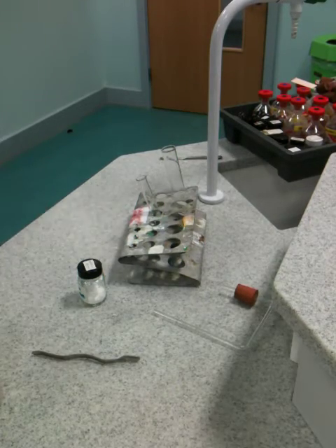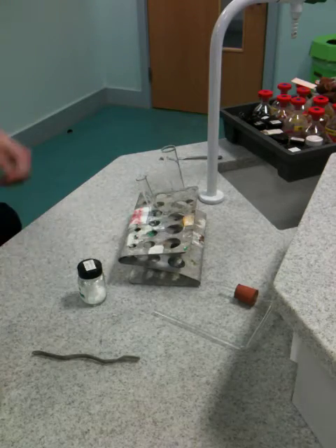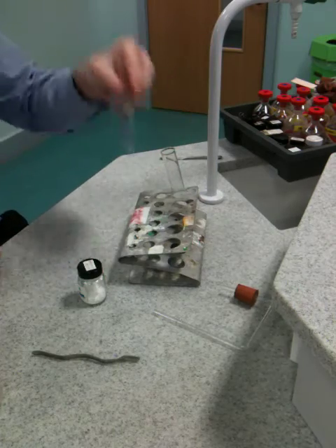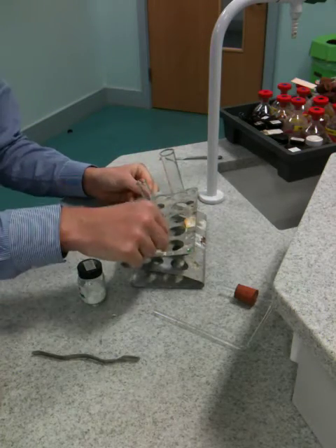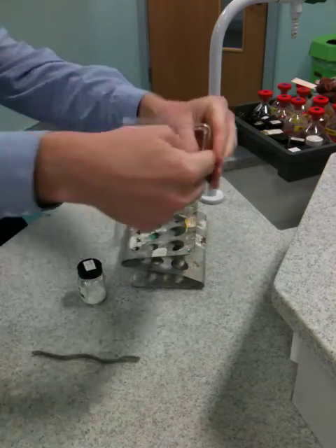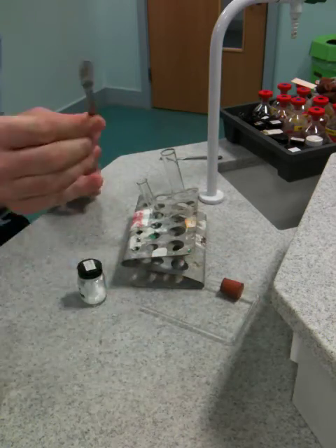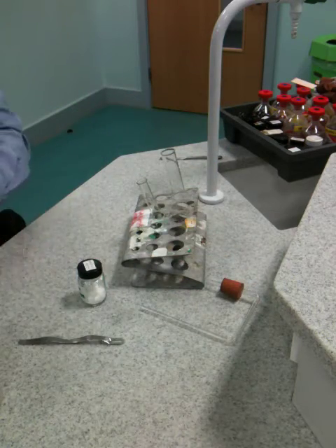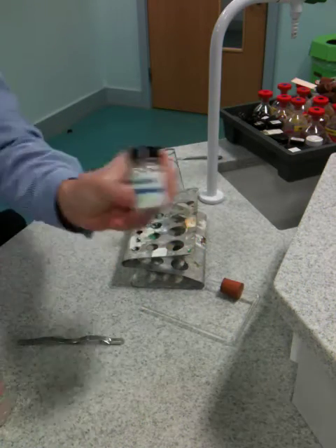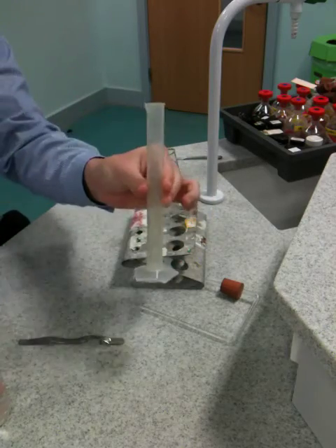Good morning — practical time. This involves acid, so you're going to need to wear goggles at all times. Let's look at the equipment we're going to be using: we've got a big boiling tube, a tiny test tube, a metal test tube rack that fits both, a delivery tube attached to a bung which will fit in the boiling tube, a spatula, and three chemicals — hydrochloric acid, lime water, and calcium carbonate.